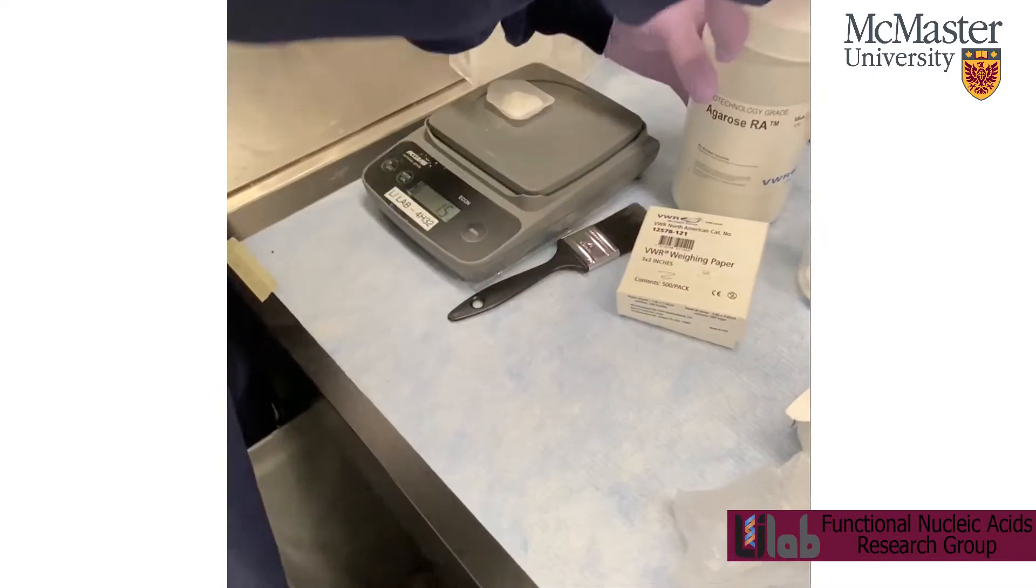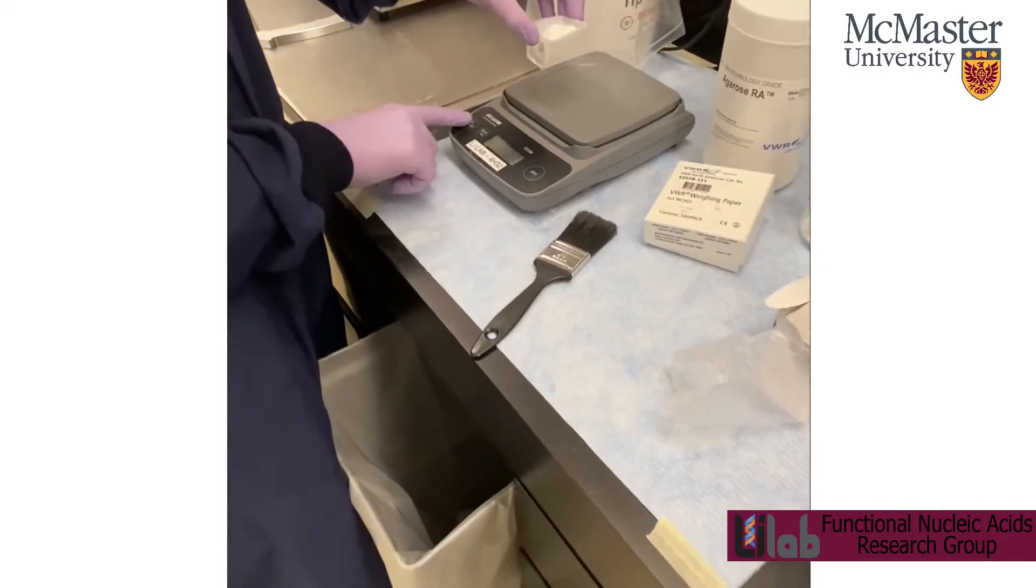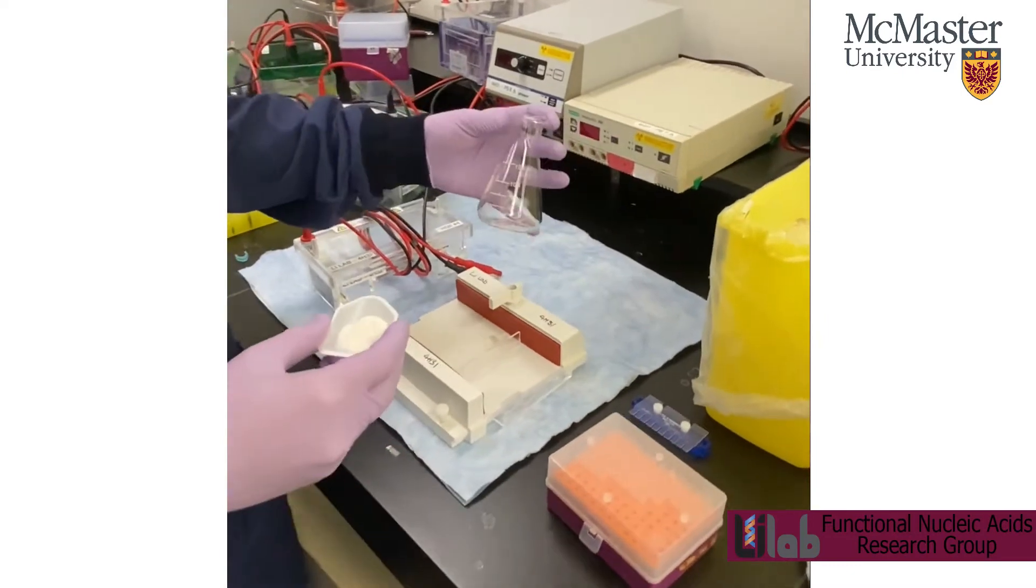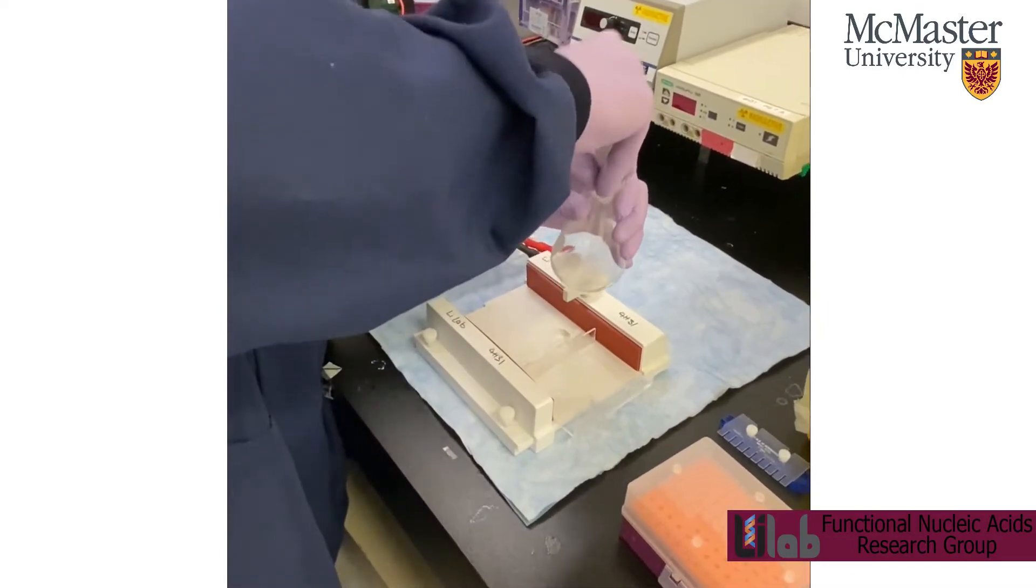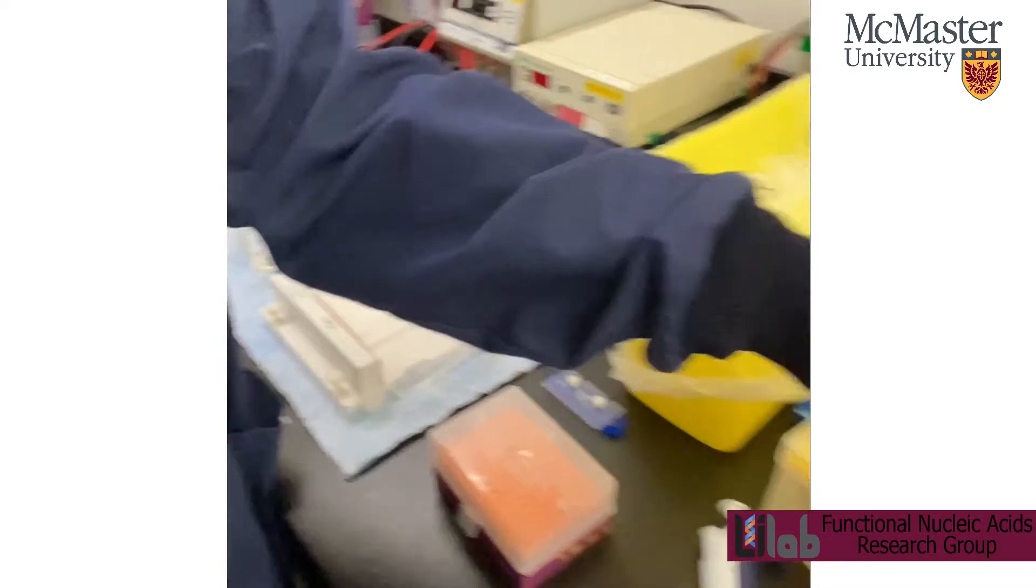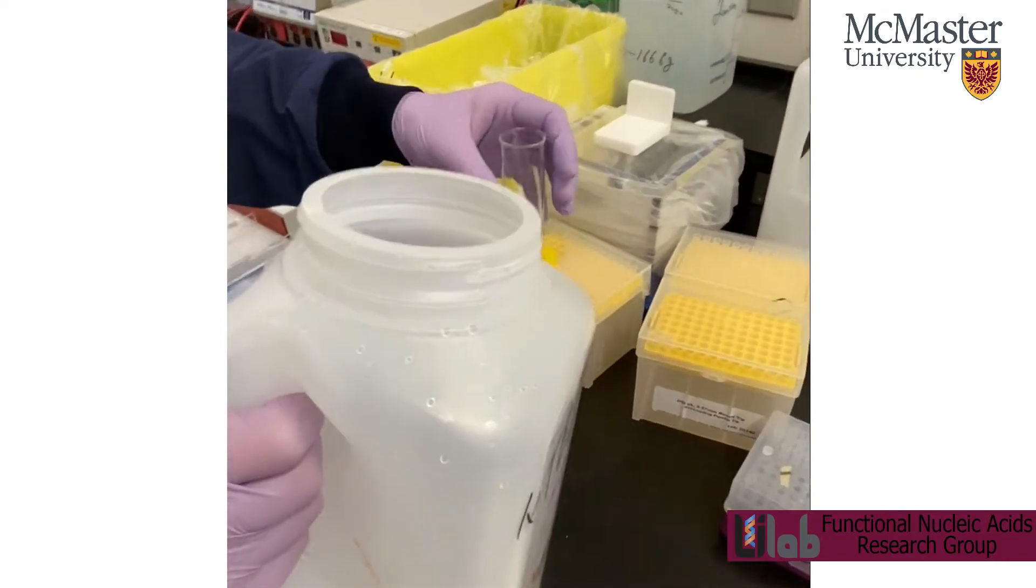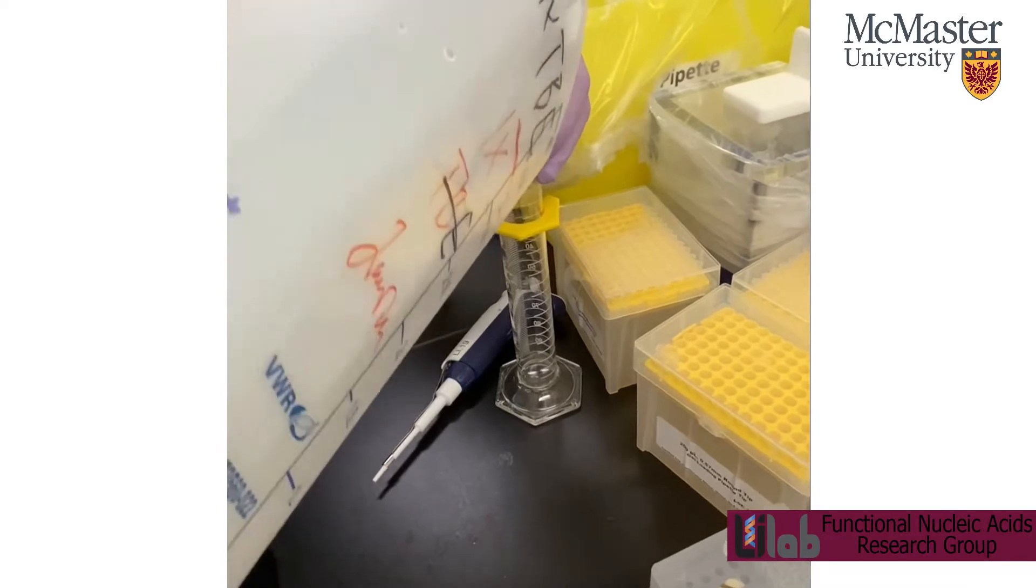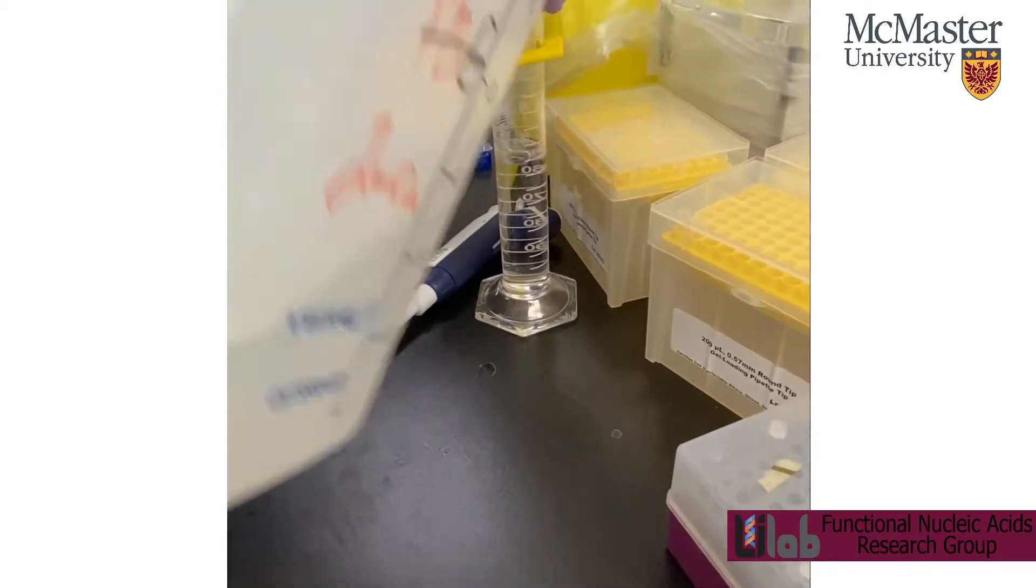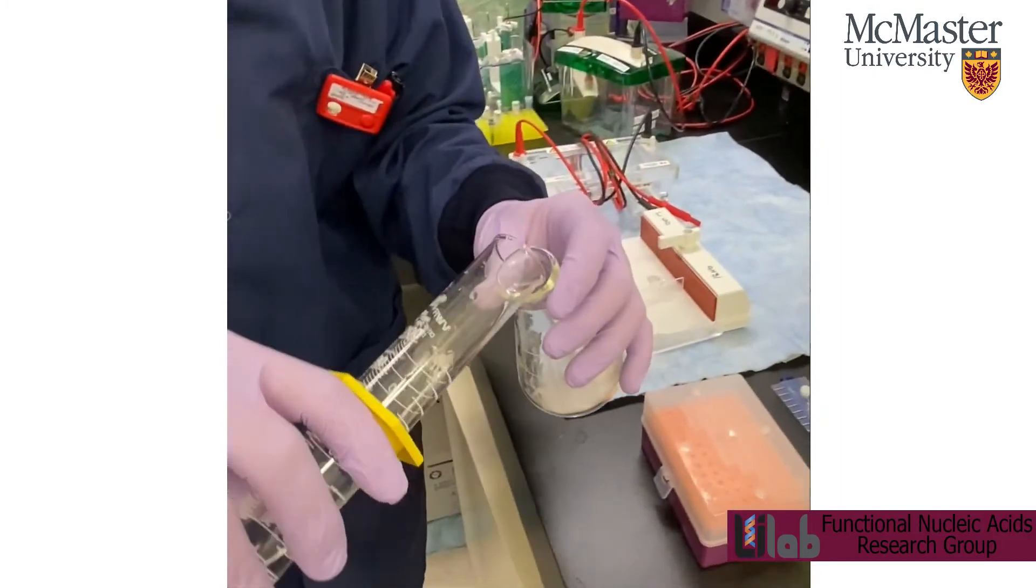Okay, so once you get the agarose you need, just turn that off. And then pour it in a 125 mil Erlenmeyer flask. This can just go in the garbage. Then pour it with 50 mils of TBE or TAE, depending on what you need. And then pour that into your Erlenmeyer with the agarose.